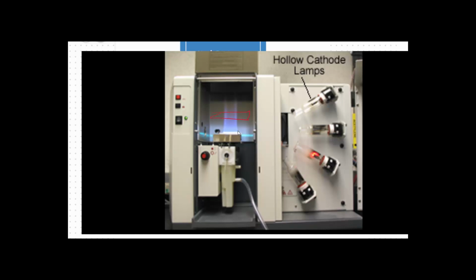It tends to be very exciting for undergrads to see such a thing. But this flame is usually about 2,500 Kelvin. Now, you do need it pretty warm because really you need to atomize your sample. You need to actually create some atoms. Well, you're not creating atoms, but you're separating the atoms from the solvent in an atomizer.